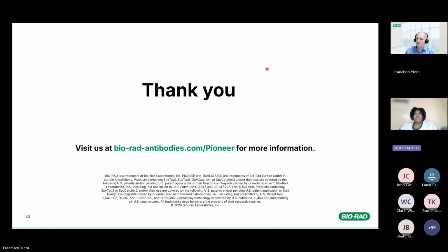Understood. Then William Clark, thank you so much, William, for your engaging questions. How do you elute the SpyTag antibodies? We have a protease cleavage site built in between the coat protein and the SpyCatcher. So we can use a protease cleavage step to elute the phages, so the antibody stays bound on the antigen on the plate, and the phages are eluted and then used for infecting bacteria.